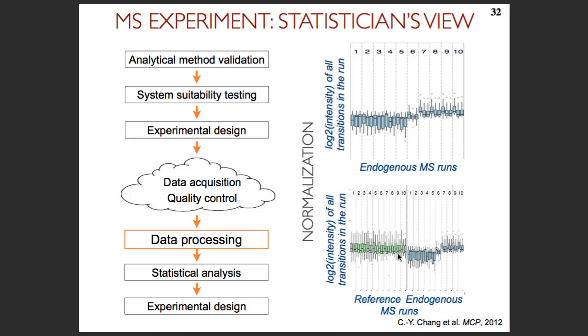Oh boy. Well, the first suggestion would be to design the experiment to avoid that, right? If it's not possible because of the biology, then my second suggestion would be to understand your biological system better before going into a large-scale experiment. Try to have some pilot studies where you experiment with different types of standards, trying to understand exactly how things are changing, and maybe do some simulations, generating fake data on the computer which would look like your studies.